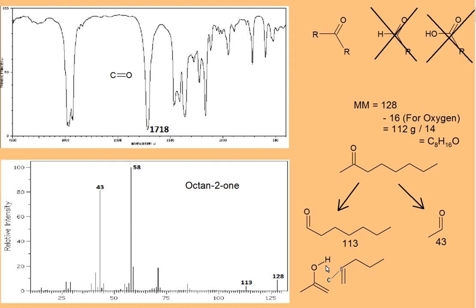Alright, let's go through this in order. The hydrogen, which was attached to the carbon here, makes a bond to the oxygen here. The pi electrons swing around here to maintain the oxygen's octet. That causes the accompanying carbon-to-carbon bond here to break, and the electrons, when that bond breaks, swing round to make the carbon-to-carbon double bond. It's what we call a McLafferty rearrangement, and this piece here explains the peak at 58. Quite often for a ketone or aldehyde, the tallest peak tends to be from this kind of McLafferty rearrangement.